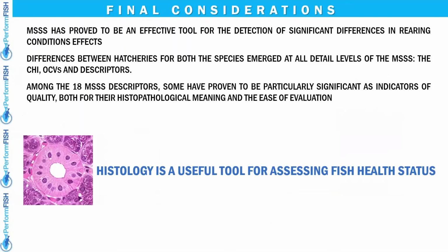Some final considerations, but just one consideration. Yes, we believe that histology is a current, powerful, and useful tool for assessing the health status of fish, even with fairly quick turnaround times. But at the risk of sounding excessive, I would like to remind you of the must-have, which is the synergy with the field sample preparation operator, who must be trained, a qualified lab, and an experienced, skilled histopathologist.